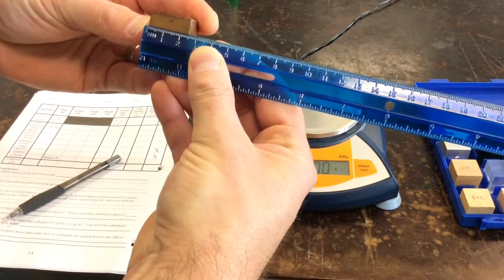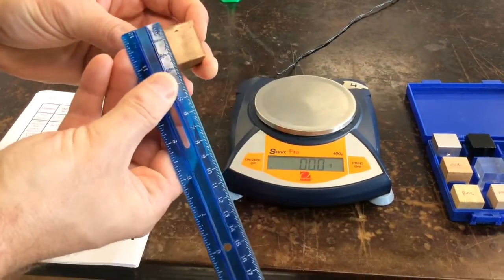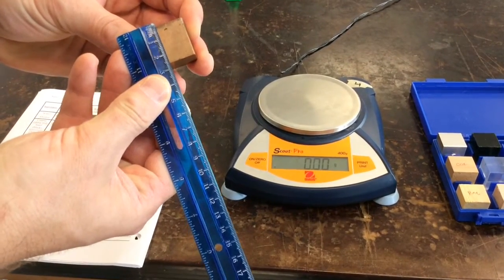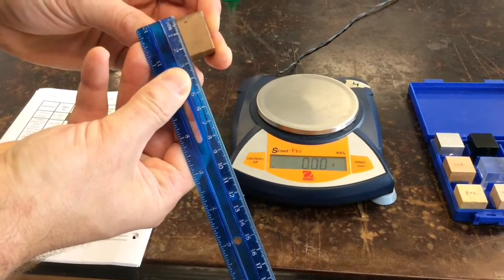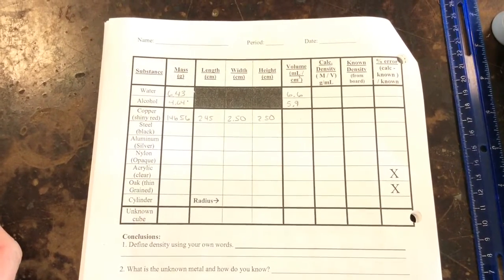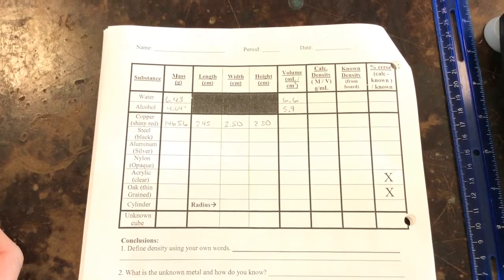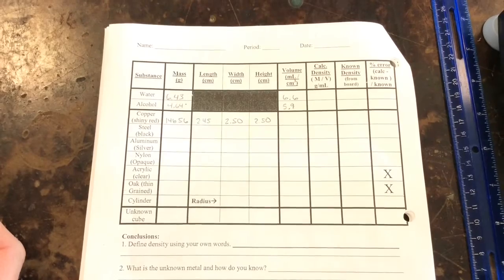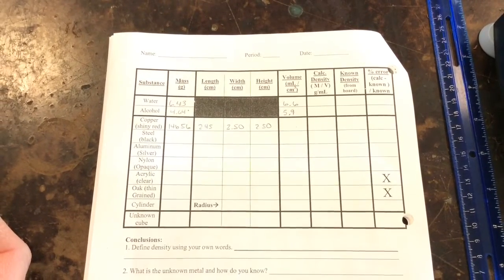This one is 2.50 centimeters. And you'll measure the height. And the height is also 2.50 centimeters. So with our length, width, and height, you're going to multiply those three together to get our volume. Once you've calculated the volume, you're going to find your density by taking the mass divided by volume.